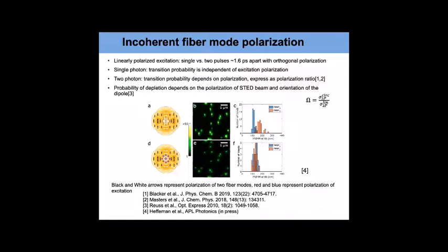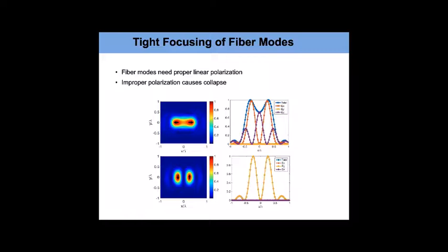Emily, can you unpack why the two depletion beams have to have opposite polarization? I guess they're being combined by polarization, but it's probably something else, right? Yeah, exactly. So if you've got radial polarization, which is kind of what you would want, and you put that in a tight focusing geometry, then you won't get that null in the center.